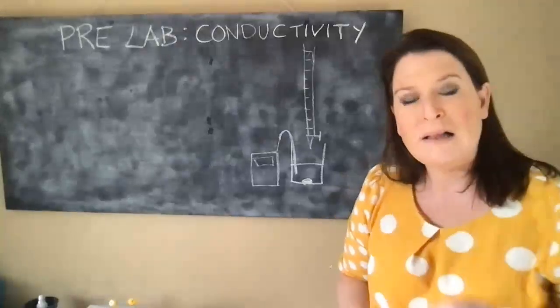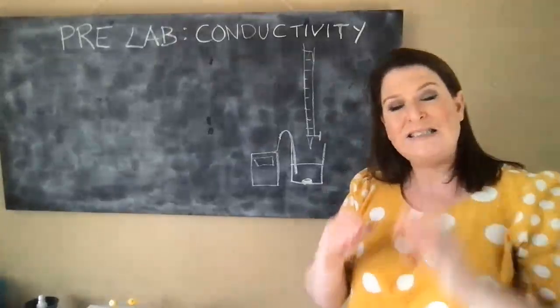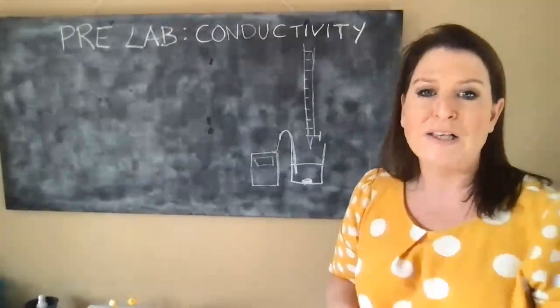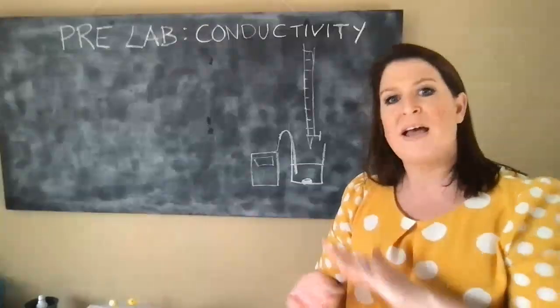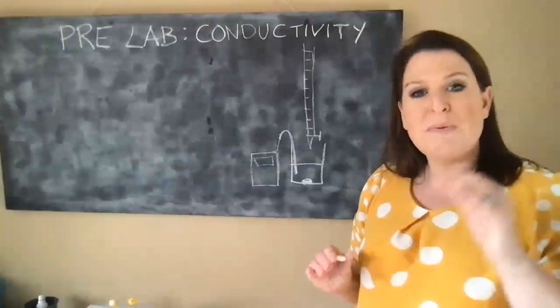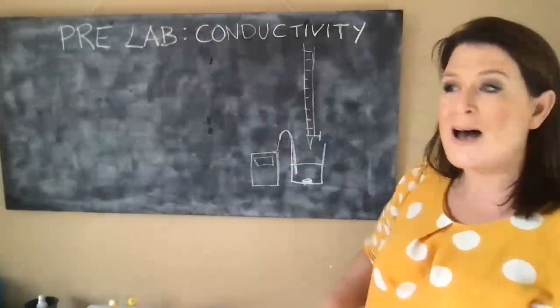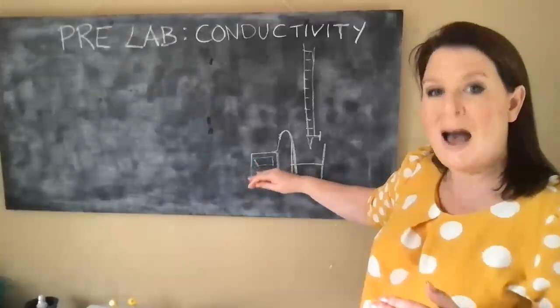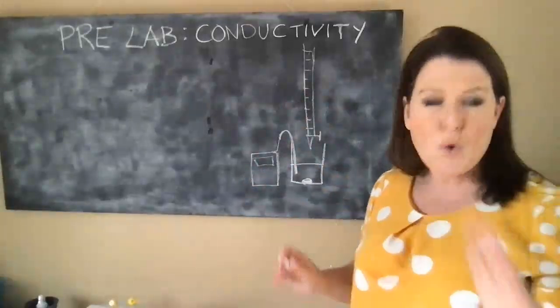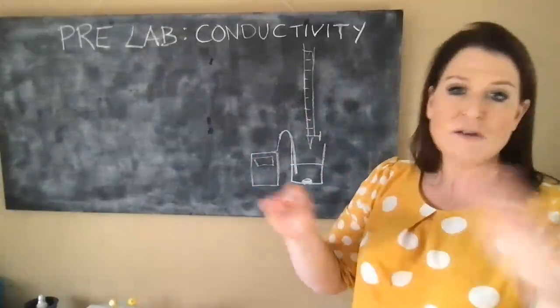The thing about analytical chemistry is it's really important to stick true to the actual values that you use. Don't say, oh, the manual said, so I have to. That's a big mistake and a big, big no-no. Just be accurate to the number of mils you actually add, and keep the corresponding values that you read accurate to that. So it's okay to make those slight changes. It's not the end of the world.